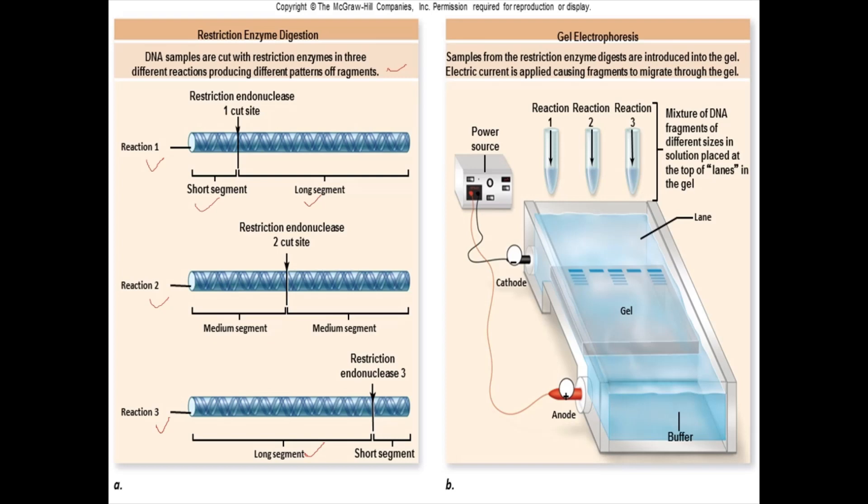Next, the samples from the restriction enzyme digest are introduced into the gel. As you can see, all three reaction samples are placed into the wells.